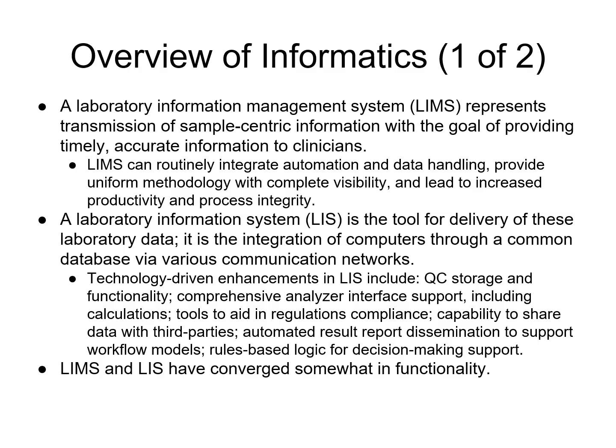Then we have our Laboratory Information System, which is our LIS, and this delivers lab data via integrated computers and databases. These features include QC storage, analyzer interfaces, regulatory compliance tools, data sharing, automated reporting, and decision support logic. Just as a note, LIMS and LIS functions have increasingly overlapped, and their functionality is getting to be very, very similar.